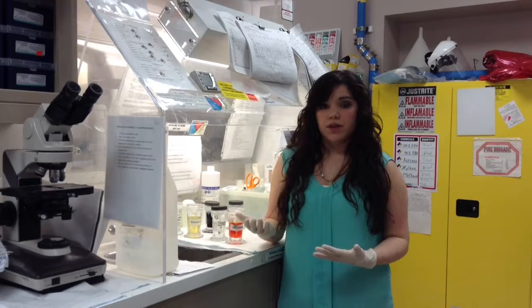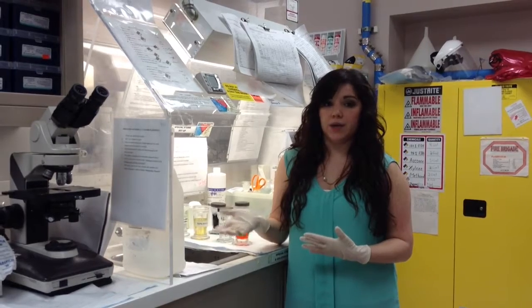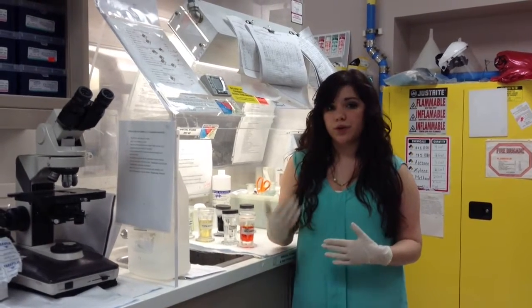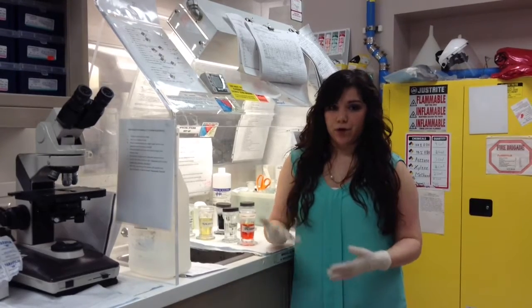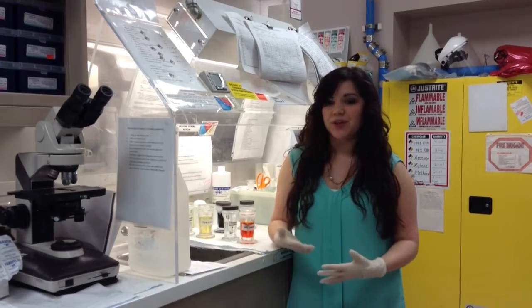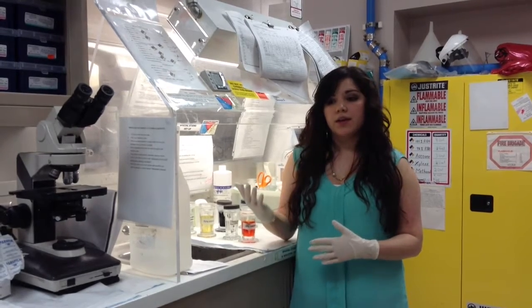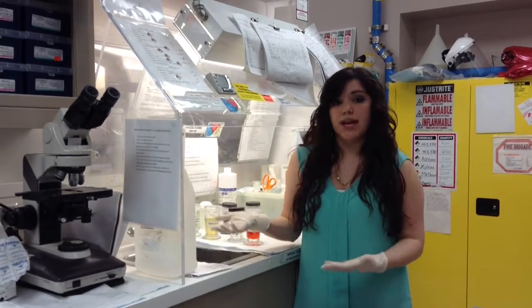But we have the opportunity to send our student down to the Special Stains Laboratory to actually see a GMS and iron stain being performed. So what you'll want to do right off the bat is call the Special Stains Laboratory and inform them that today is the day you would like for our student to rotate through if possible. Typically, they request for us to send the student with a few cytology specimens for them to actually process.